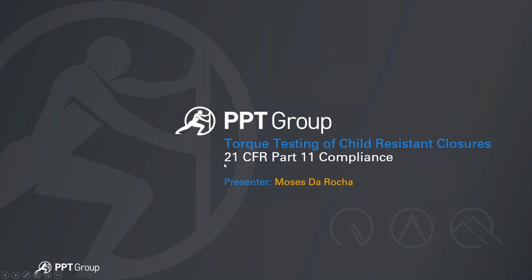So again, the topic for today is going to be torque testing of child-resistant closures, with a little bit of emphasis on how our current testing software is compliant to 21 CFR Part 11. I have to throw in a couple of caveats at the very beginning.